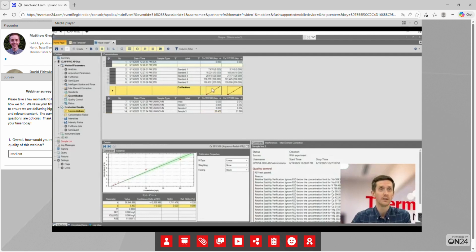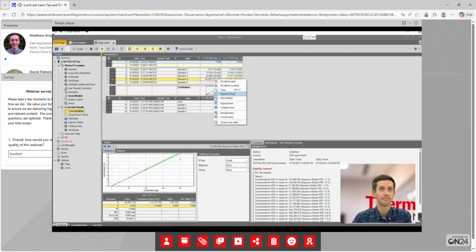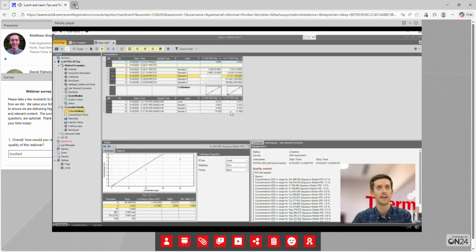So first of all, we need to establish how or where does our linearity for our sensitive wavelength fail. So to do this, we can just keep removing some of the top standards and keep doing this until we essentially achieve linearity. We can see at the moment it's pretty poor, the R-square is pretty poor, so let's start removing some of these calibrations. We can see it's getting a bit better. Let's keep removing them, and okay, not too bad, but let's see if removing the 20 milligram per litre. Okay, so this has given us up to 10 ppm, perfect linearity. So we can see this wavelength is good up to 10 milligram per litre, but above that, it's too sensitive.